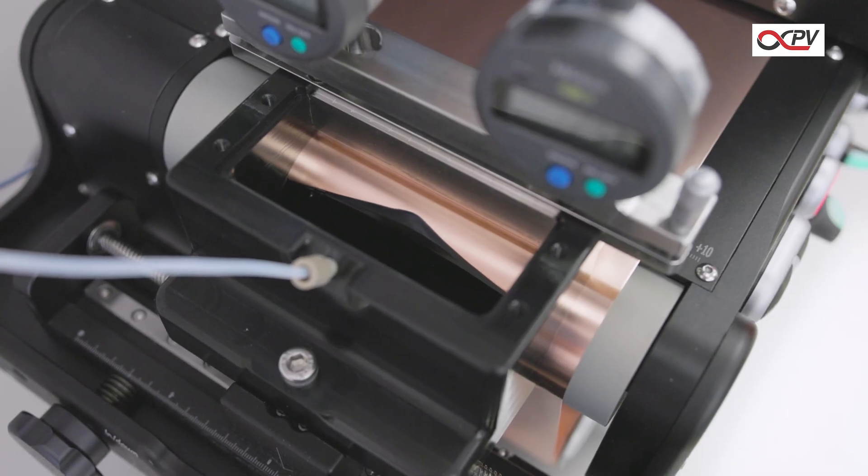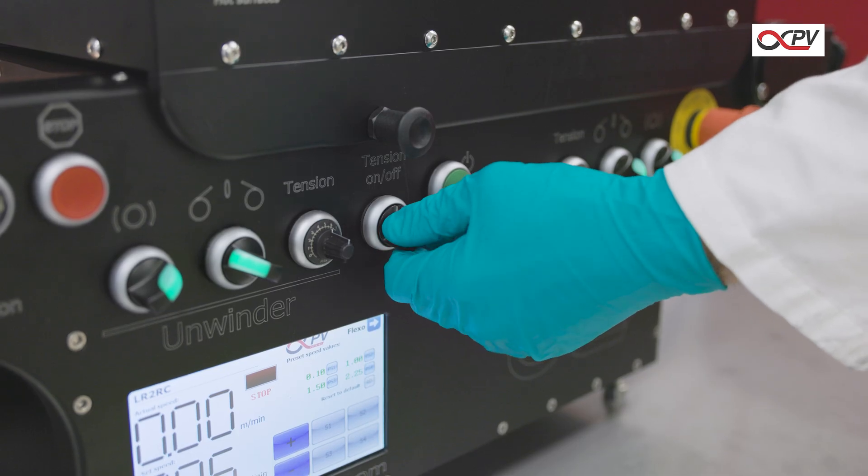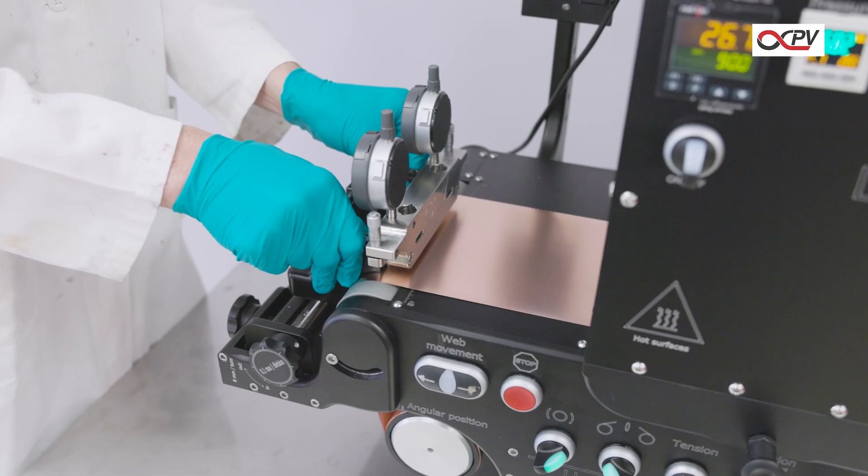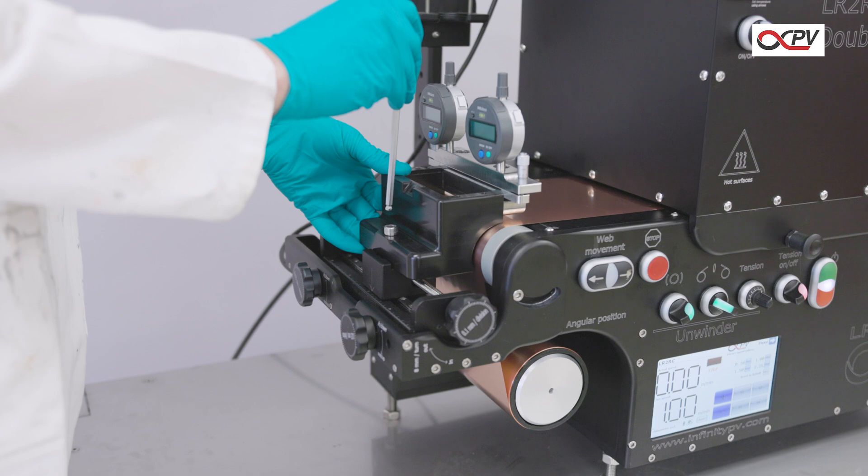Getting ready to coat is fast and straightforward. With the foil secured and web tension adjusted, mount the slurry coater onto the laboratory roll-to-roll coater platform using an Allen key.